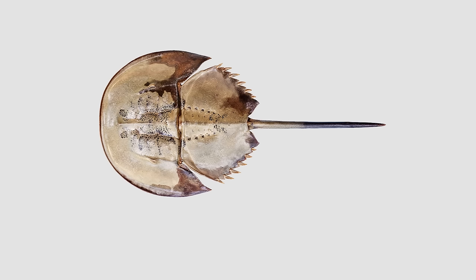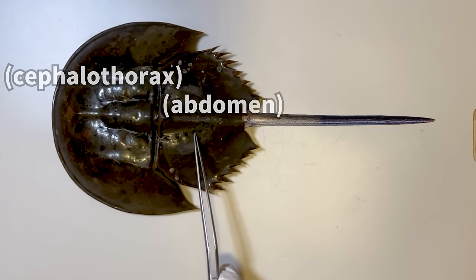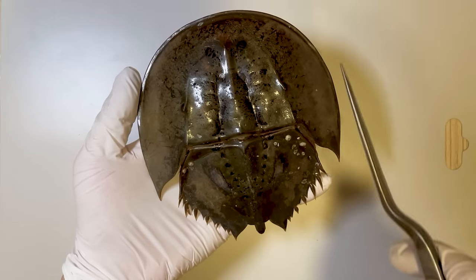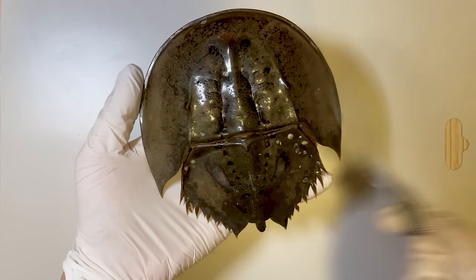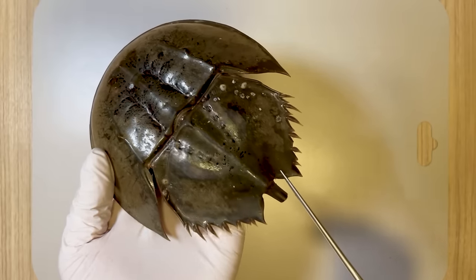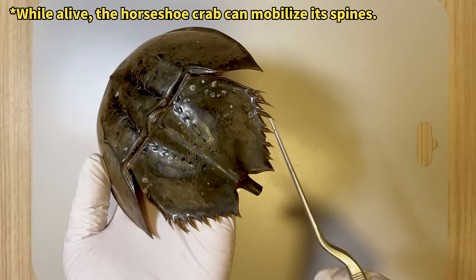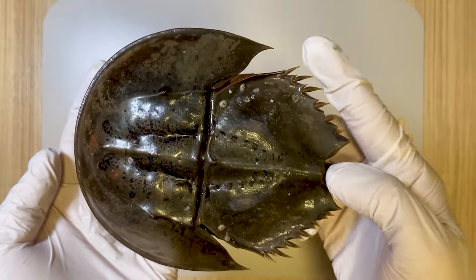Let me illustrate the anatomy of the horseshoe crab. The horseshoe crab's body is comprised of a cephalothorax, an abdomen, and a tail. The cephalothorax and abdomen are encased in a hard shell, and the abdomen bends this way. The lower section of the abdomen is armed with six spines on each side, and this area is quite sharp.